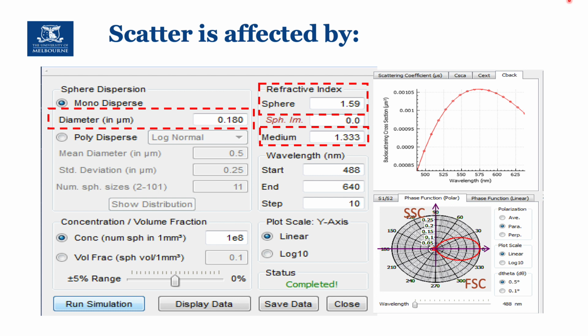For instance, if you put a little ball of glass into water, you will not be able to see it. The reason you don't see it is because the refraction index of the water is slightly close to the material that makes the beads, these glass beads, which means that there will not be bending of the light. You will not be able to see the shape. You will not be able to distinguish the sphere from the surrounding liquid. So the refraction index ratio is very important.